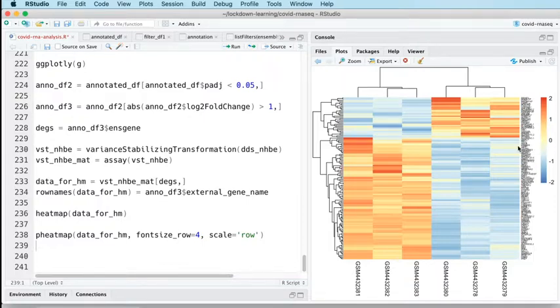So you've got samples which have expression higher than the mean and samples which have expression lower than the mean, effectively, in each row. And generally speaking, you can see that you've got 3 yellowy orange samples on one side of the heat map and 3 kind of yellowy blue samples on the other side of the heat map. So this is showing you, okay, well, here's a set of genes which have higher expression in these 3 samples, which, looking at the numbers, these are the mocks.